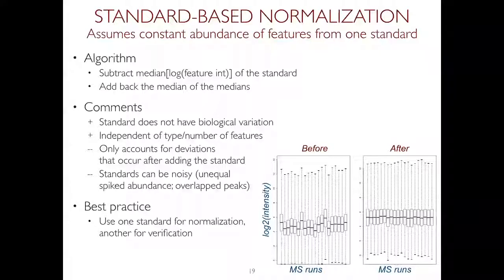But you're right. This is something that you could do, and it is called non-specific filtering. The most important criterion there is that you do not use the information on biological conditions. Essentially you cannot use the same data twice, once to filter and then to do statistics on. So it has to be external. Non-specific filtering means it doesn't use the information on conditions. For example, if you have a very high CV, maybe 20% is too low, but let's say 40 or 50%, you can say, I'm removing every feature which has a CV of more than 50.